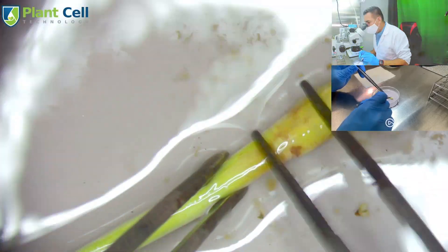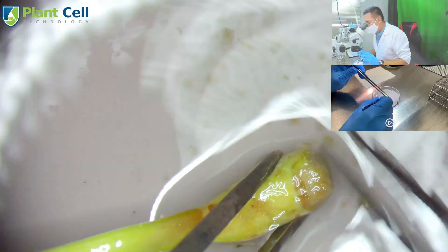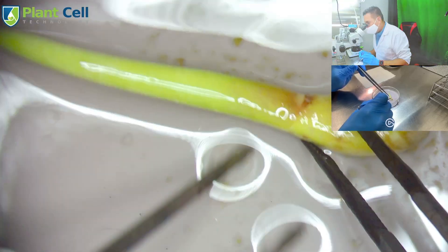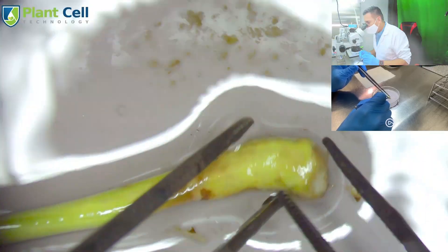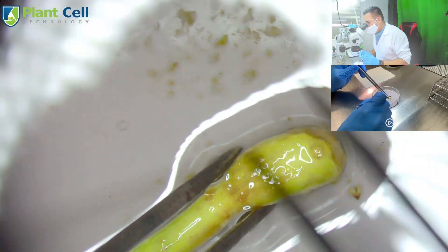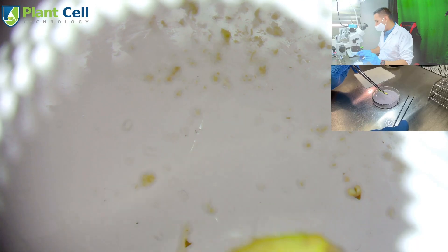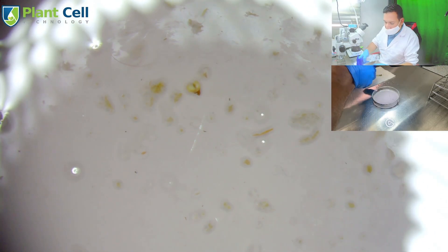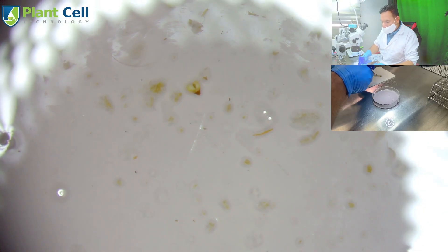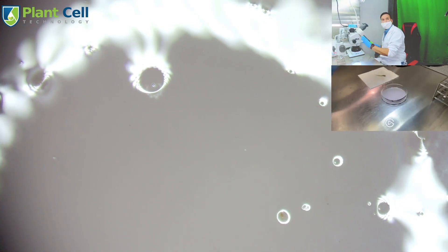Bleach loses its strength over time. I was actually quite surprised how healthy the plant looked with just 20 minutes of 10% bleach — I think new bleach would have done a lot more damage a lot quicker. So my bleach was probably not as effective anymore. I'm going to give it another spray with alcohol and place it on this sterile paper towel, which has also been soaked with 70% isopropyl alcohol.